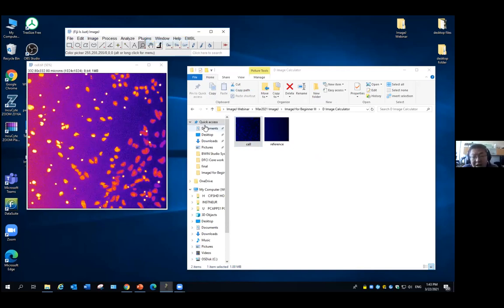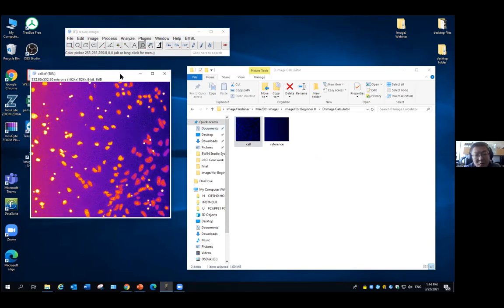And we want to correct it. The best way to correct it is to go back to the microscope and realign it. Another way is, sometimes the system is too old and some mirrors you cannot tune much. So if this is the best I can do to get a raw image, what we can do is get a reference image of how the uneven illumination is. Then we normalize to that reference image.